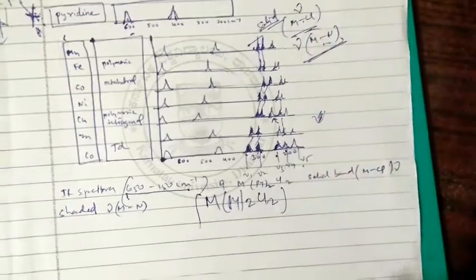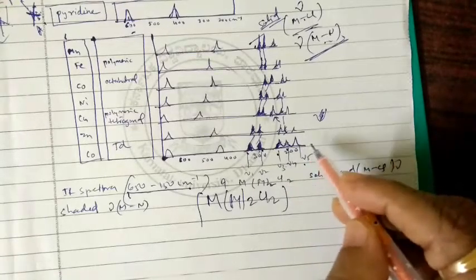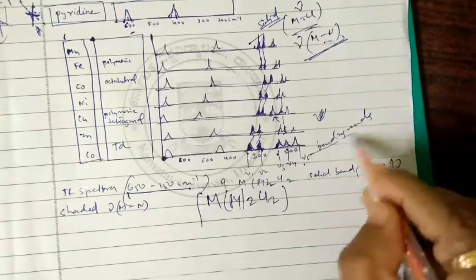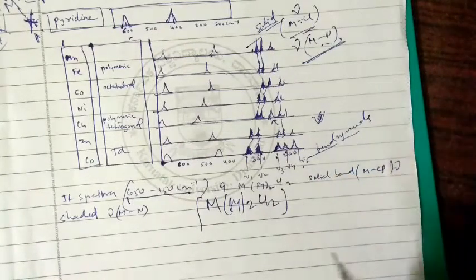And new 5 has been assigned for the bending mode.